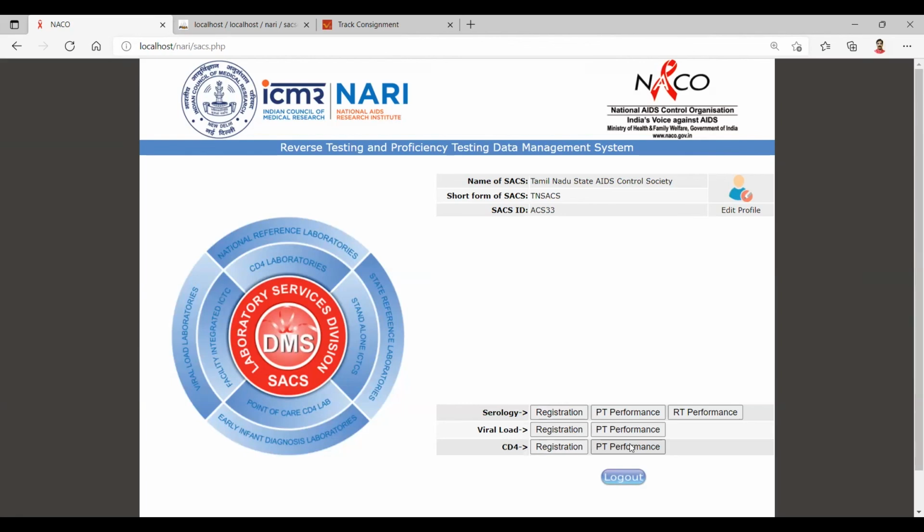Maybe the person who is supposed to approve has been absent for the last 2 days or so. Most probably they will release the report in 1 or 2 days. So till then it is under process. The rest of the things you already saw in the PT performance of the serology and viral load, and the same as CD4 you can also see in a few days.